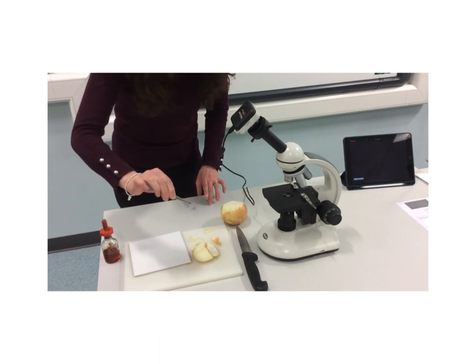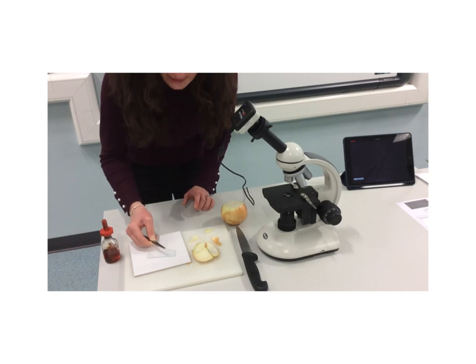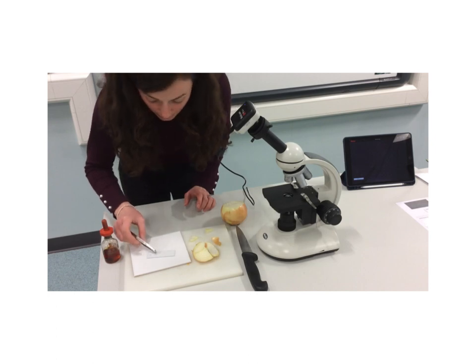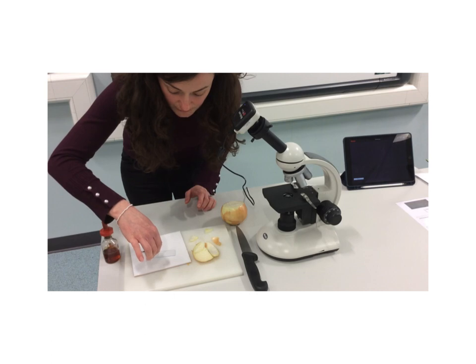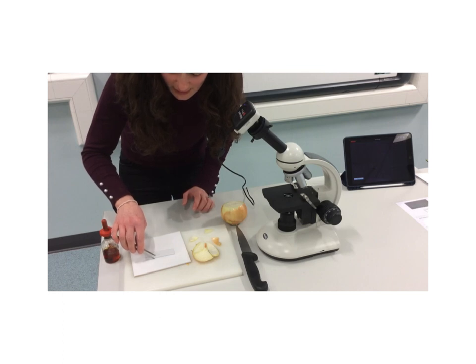Okay, so I'm going to put it on one of my slides so that I can see it, trying to get it as flat as possible. Remember we talked about before Christmas, sometimes we can see wee air bubbles in our images, and those are not ideal, and sometimes they block what we're trying to see. So you can see there, I'm just using my tweezers if it'll stick down.